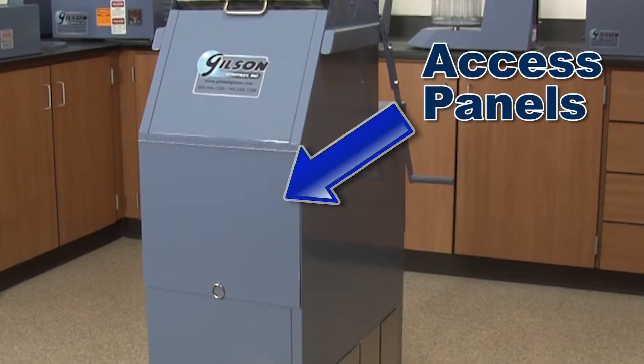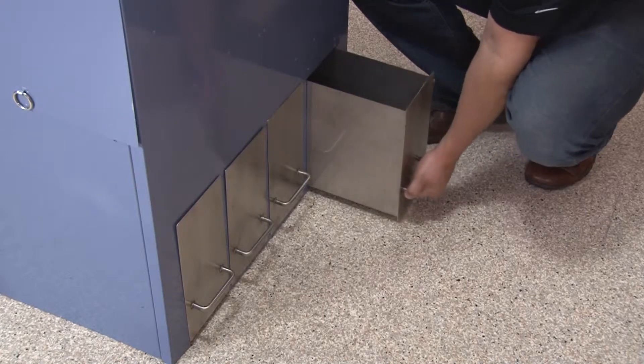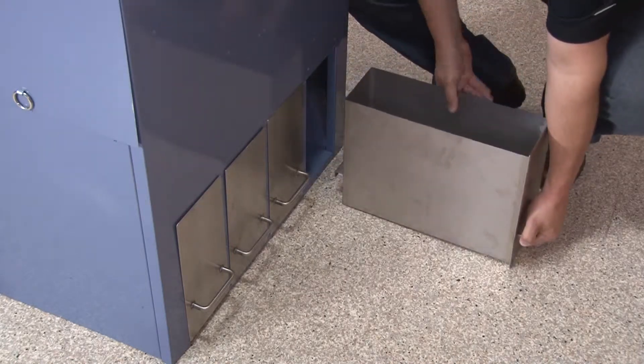Hinge-mounted side doors allow for easy inspection and cleaning of chute sections, and sealed sample pans slide out easily using the handles provided.